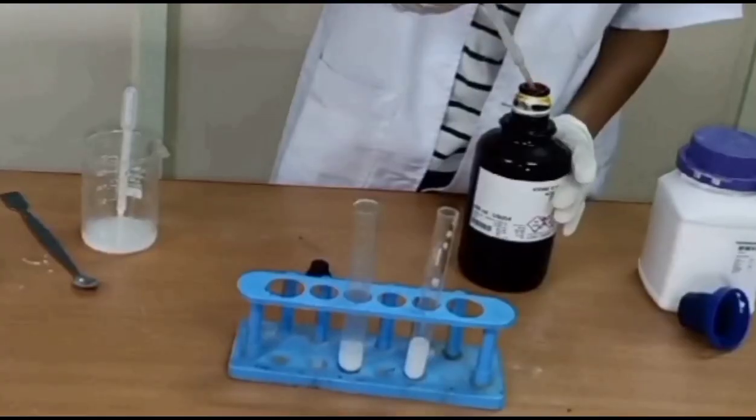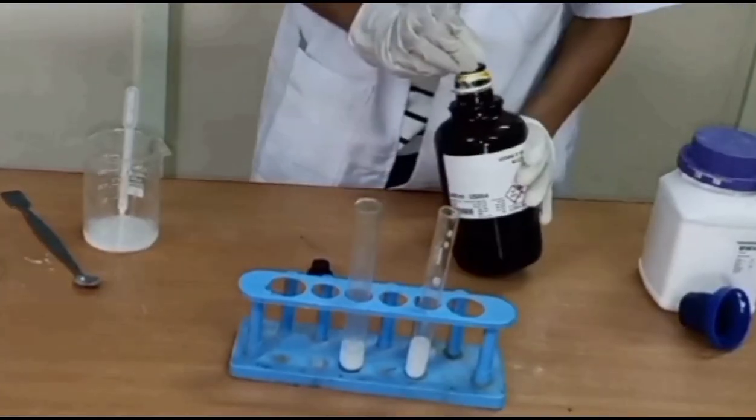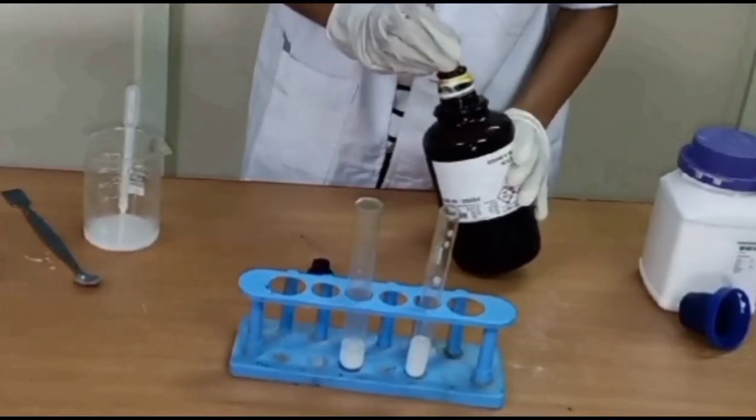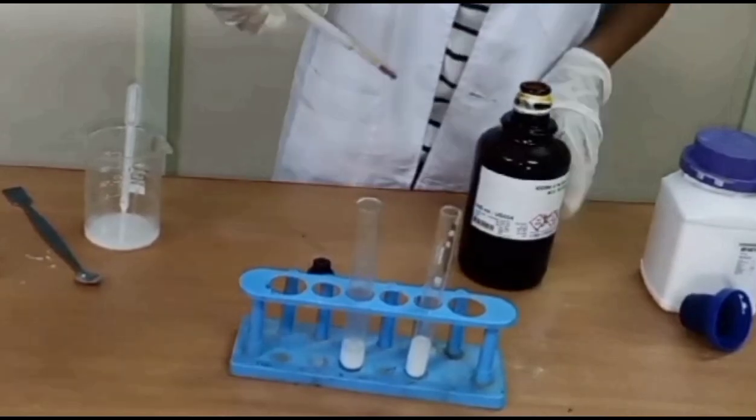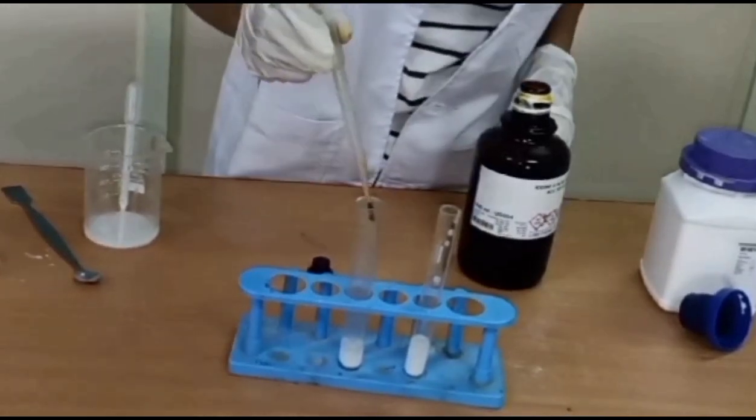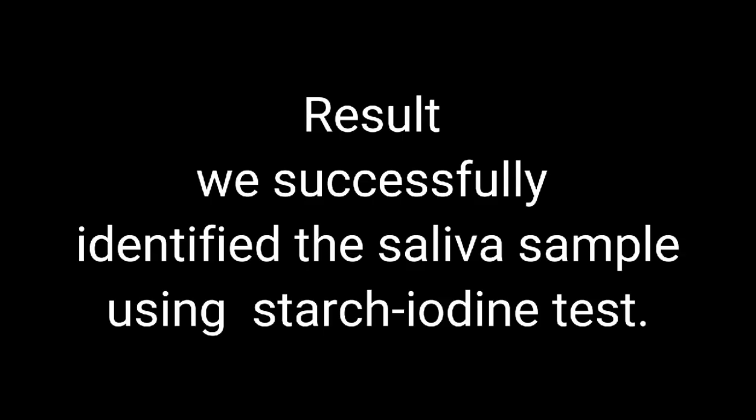Add some drops of iodine solution in both test tubes. After some time, in test tube B, in which saliva was added, it decolorized and turned white color. Successfully identified the saliva sample using the starch iodine test.